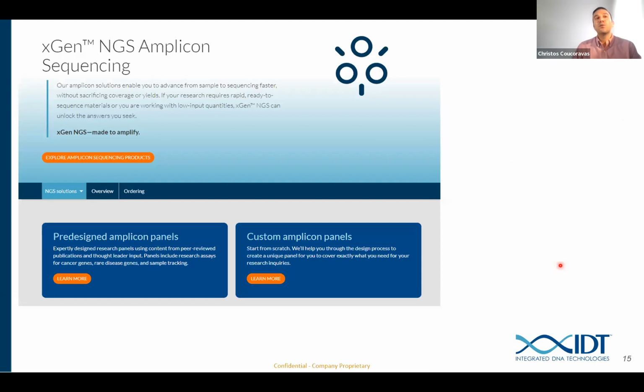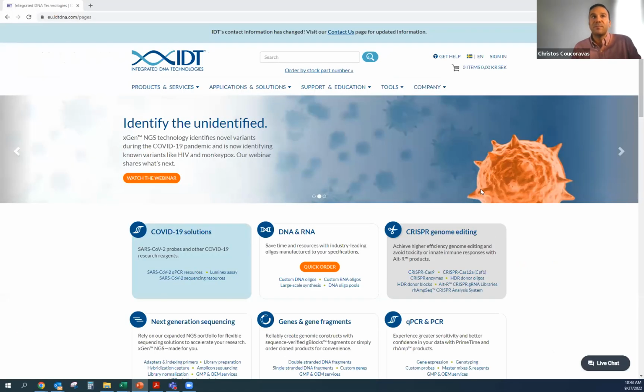At this point, I also wanted to explain how you can create your own amplicon panel. So I will just stop my presentation for 1 second here, and I will go to our website. Can you see my website?